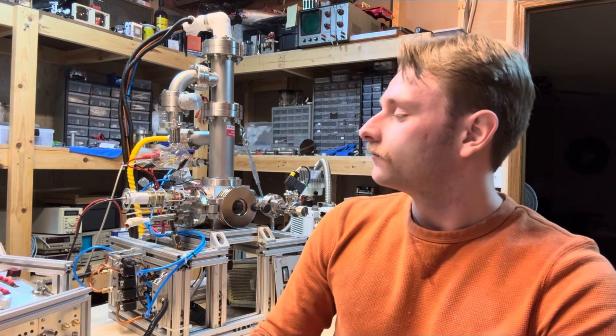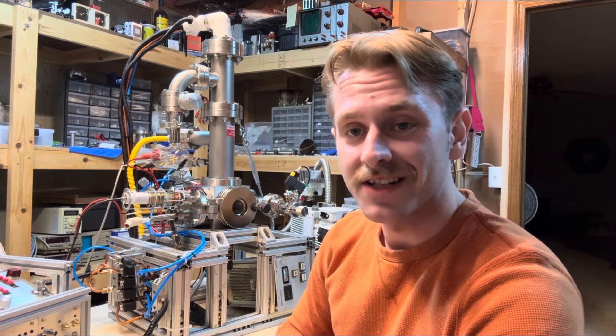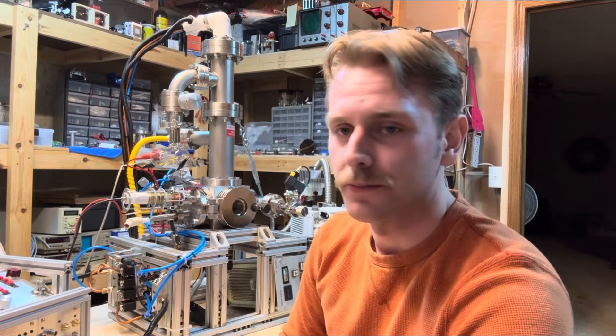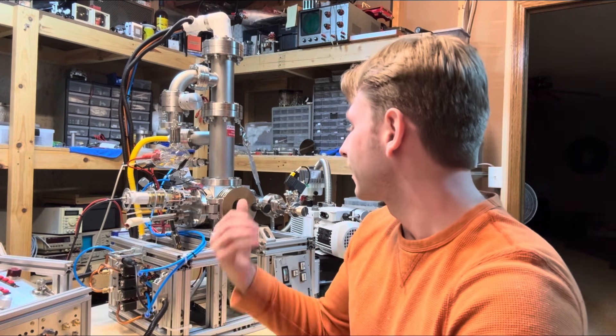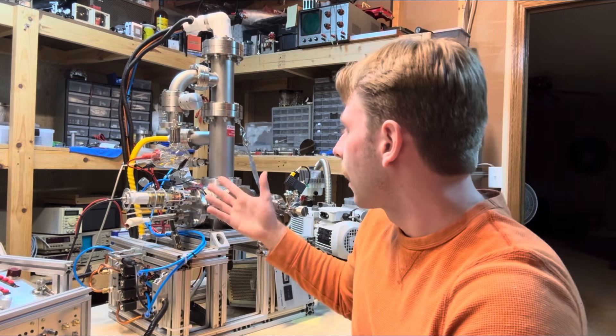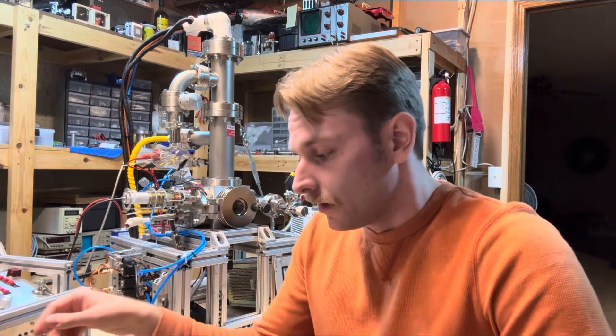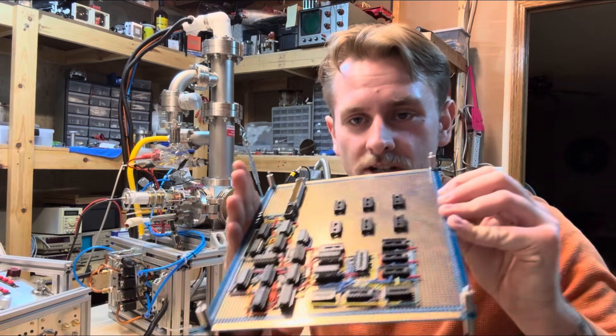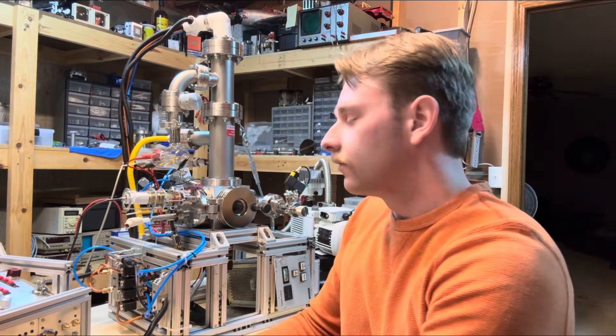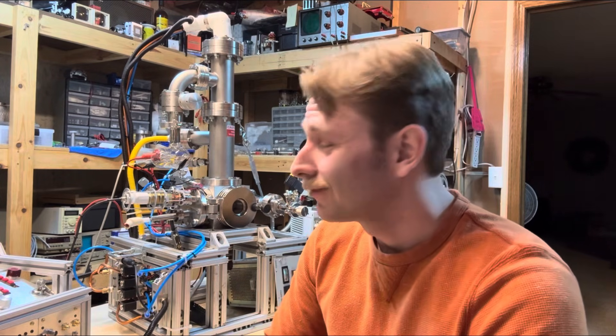But this vacuum chamber, we'll talk about that. It's all made of ConFlat parts, which are so expensive for good reason. They're pretty good, but also the gaskets are expensive. Now, the reason I got it like this is because I knew it's going to have the most modularity. I'm going to be able to find ConFlat parts. Applied Science, he used a big bell jar, but for me, I like to do my circuits like this. I also like to do metal work.